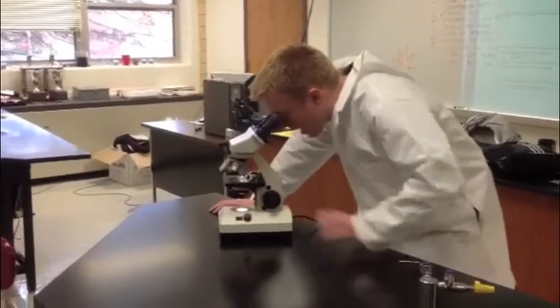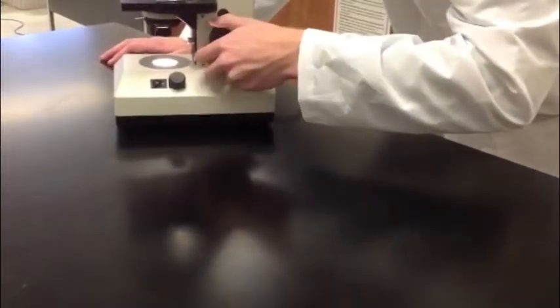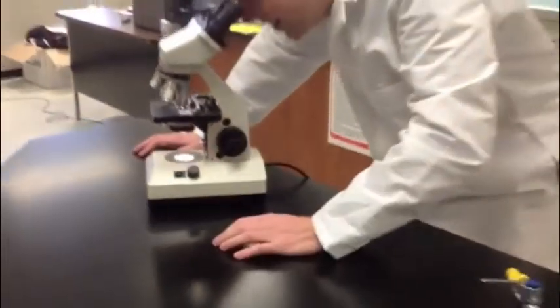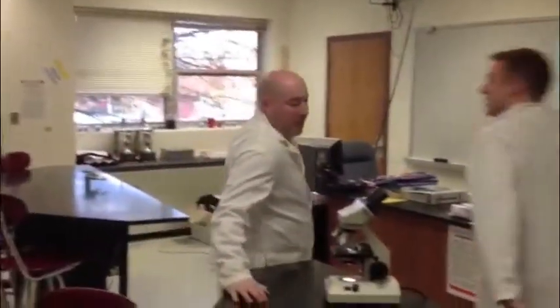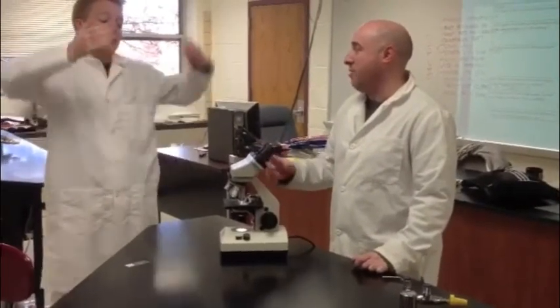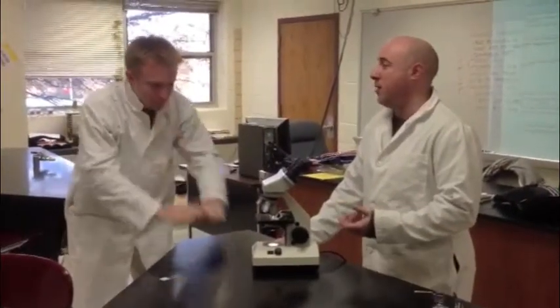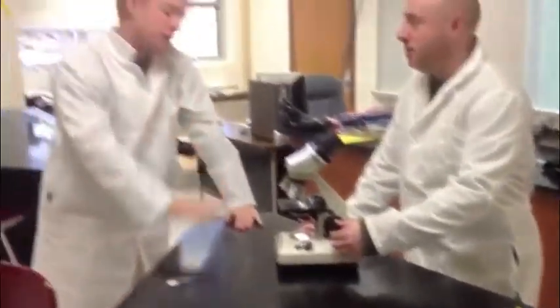I broke the slide! How did that happen? What happened is the coarse focus knob actually moves the stage up and down. When you're on a high power objective, the lens gets too close to the slide and can crack either the slide or damage the objective lens. What you need to do on high or even low power is use just the fine focus knob for precise movement. So just the fine focus on the high power and low power. Yeah.